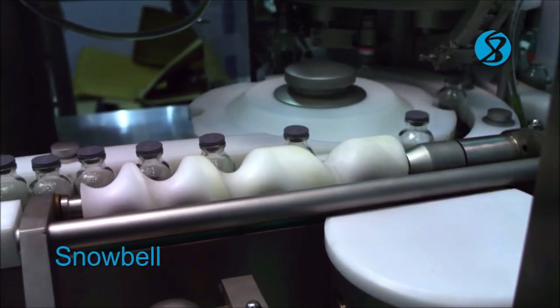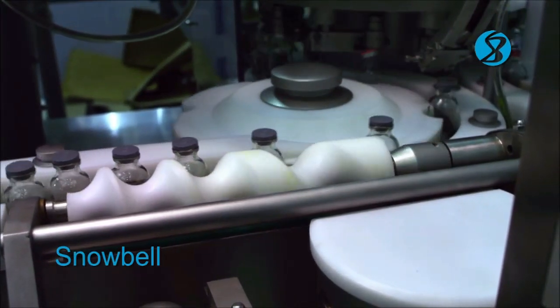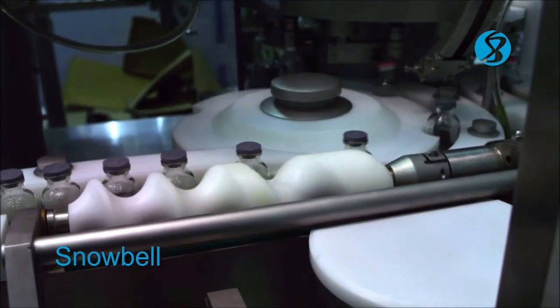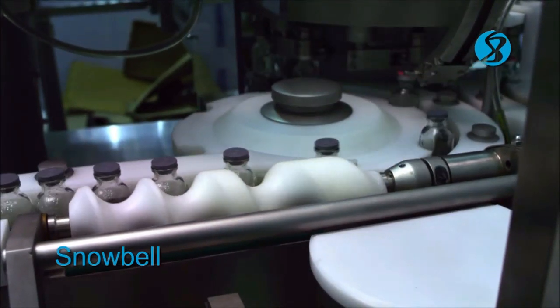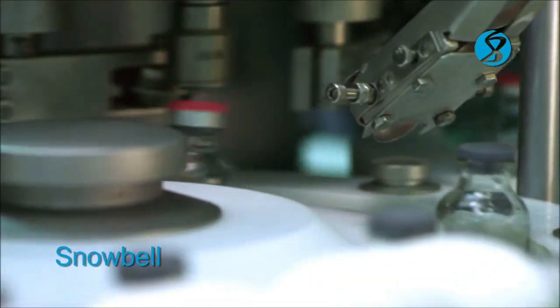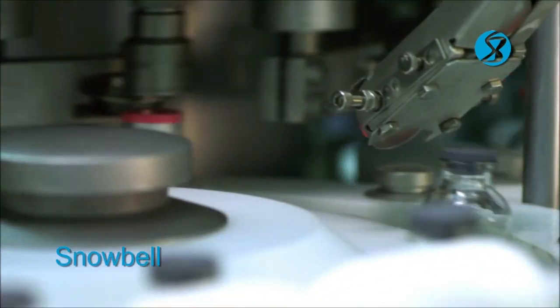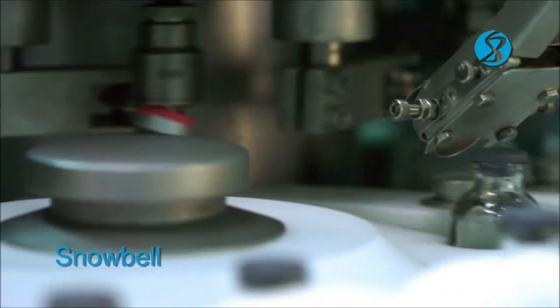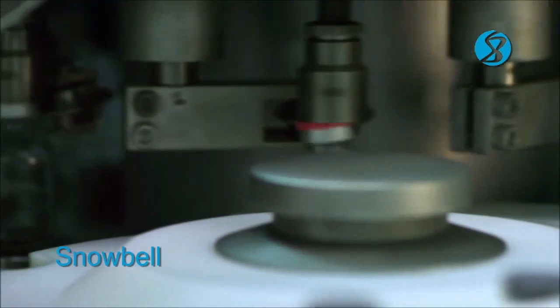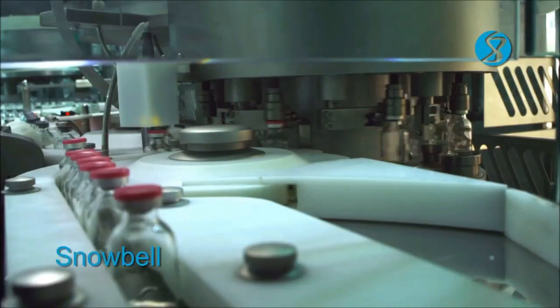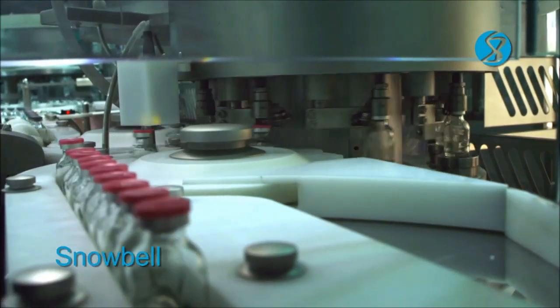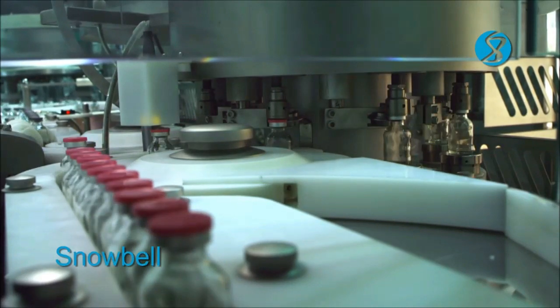Each vial is supported on a revolving spring-loaded platform and the mouth of each vial with the cap is held by a chuck. A cam driven sealing roller engages the lip of the cap and during its rotary motion effectively completes the crimping process. At the exit of the sealing drum the sealing roller disengages and the sealed vial is carried by the outfield star wheel.